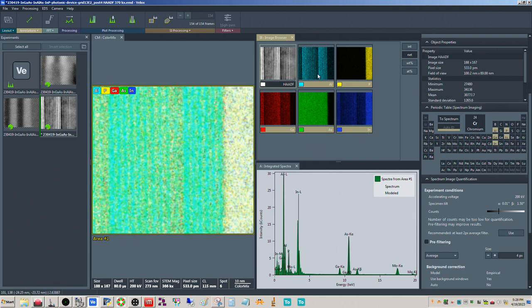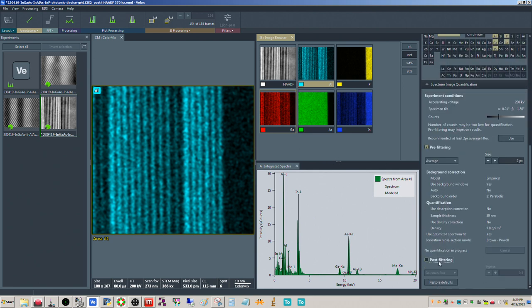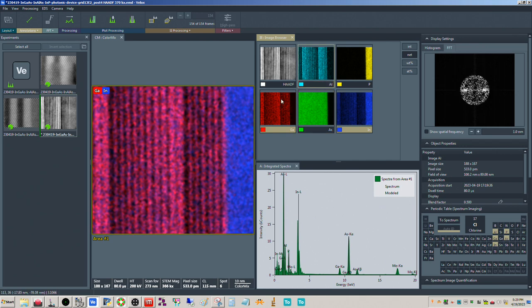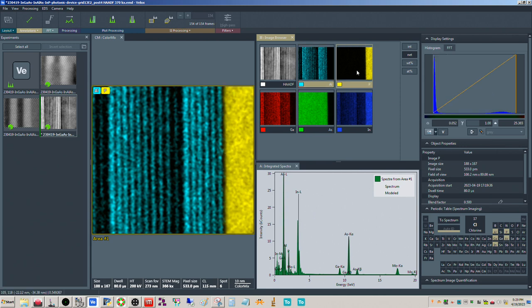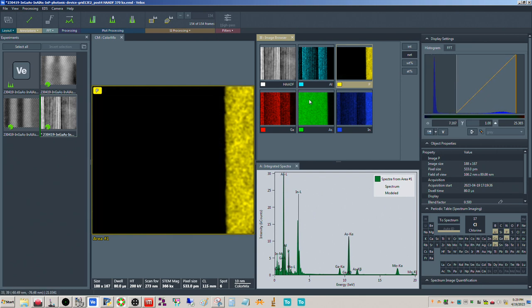We're seeing, this looks really good. But let's pre-filter it. So we'll do 2 pixels, like it's saying. Yeah, and that improved things quite a bit. We still have the Gaussian on. If we turn the Gaussian off, it still looks pretty good, but we'll leave it on there. Fudging with the black level may help here anyway, just because this is a little too busy with the three elements here. So if we bump this up, something like that.